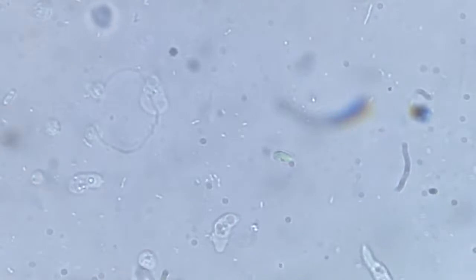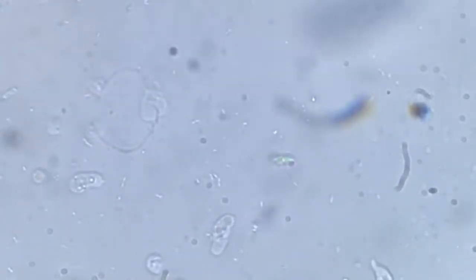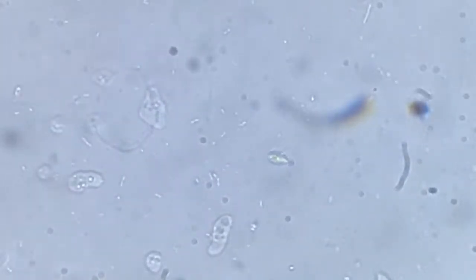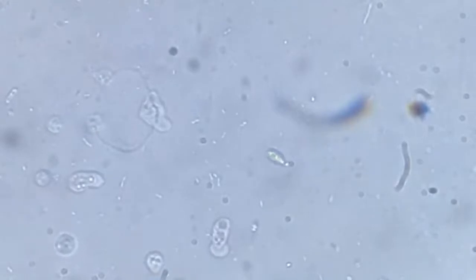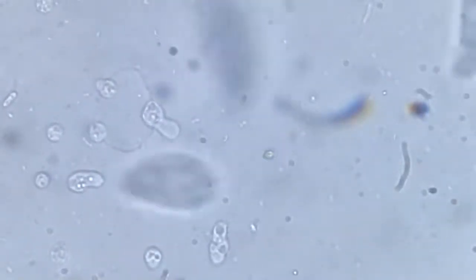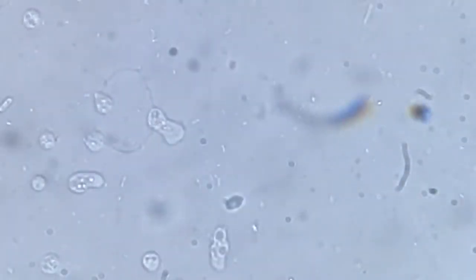Since they all are in different planes, it's not possible to focus them all at one go. If I focus one, the other would be out of focus. So I'm just trying to focus the one which is near 7 o'clock and has some prominent cell organelles and inclusions.